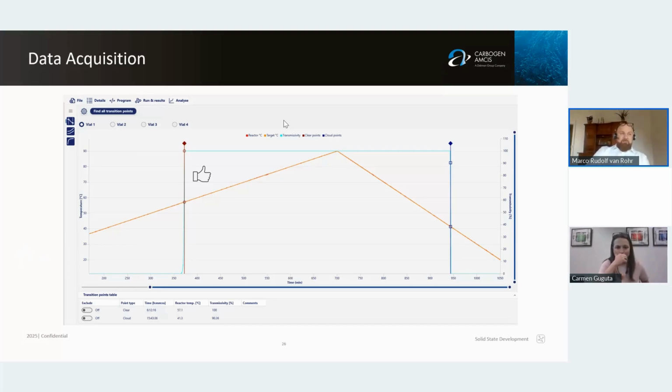If I present the work to a customer, I take 3 cycles as default, and sometimes I take more for certain reasons.